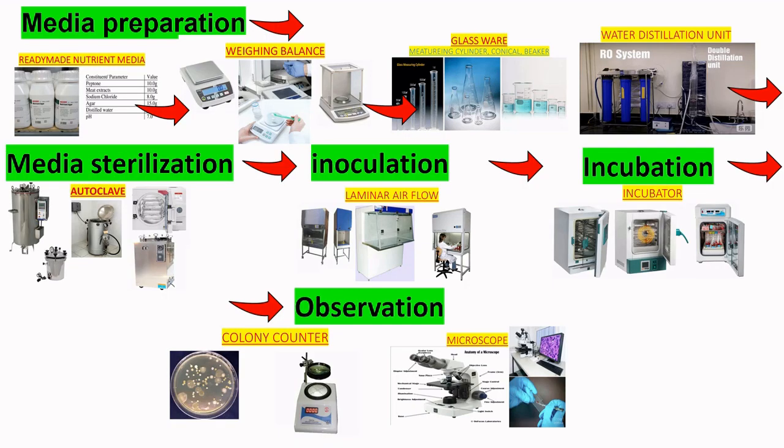Okay, so first, this is the whole microbiological lab, that is the whole work which is done in a microbiology lab. So first is the media preparation. The first step in any microbiological analysis is media preparation. First is the ready-made media which we can get in the market.